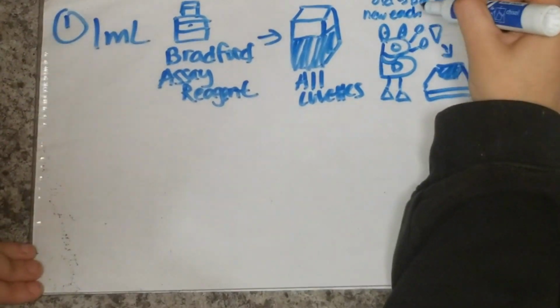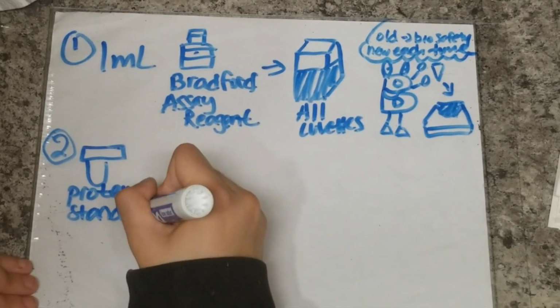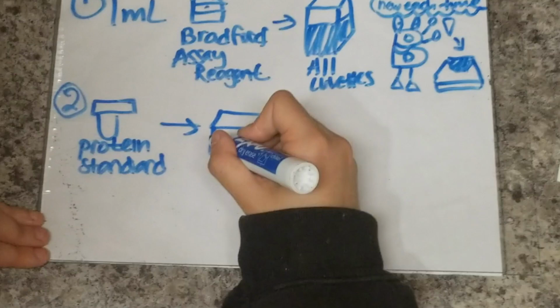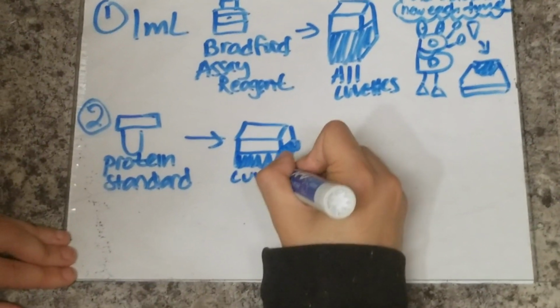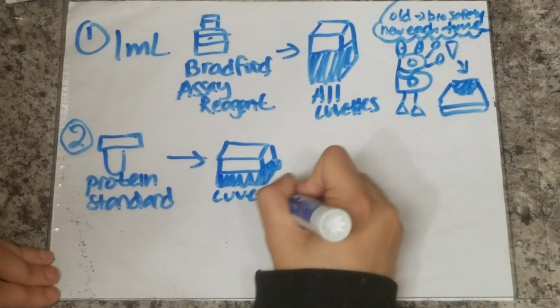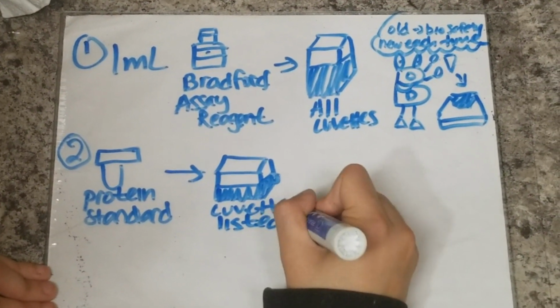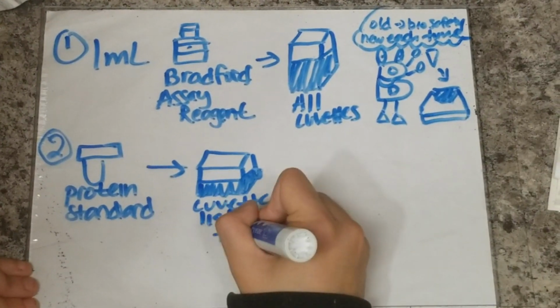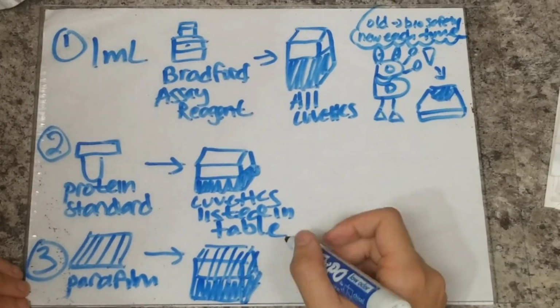After that, you will want to add the correct concentration of protein standard to 7 of your Bradford Assay reagent cuvettes, as you laid out in the table you planned. Make sure to set one cuvette as your control and only add PBS to the Bradford Assay reagent, and to use another cuvette to contain your protein of interest. Parafilm your samples and invert them gently.